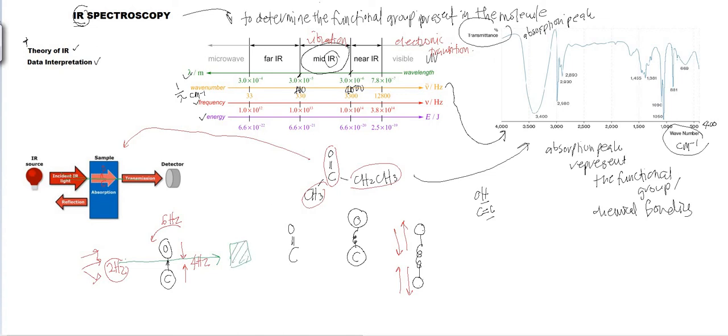That is why when you look at the spectrum, I drew it here, actually you can look at it here, but it's okay, just put it the other way here. That is why the data for the y-axis is the percentage of transmittance, and you can see that the peak is downward. Because the spectrum is plotting the percentage of transmitted light, how much is transmitted.